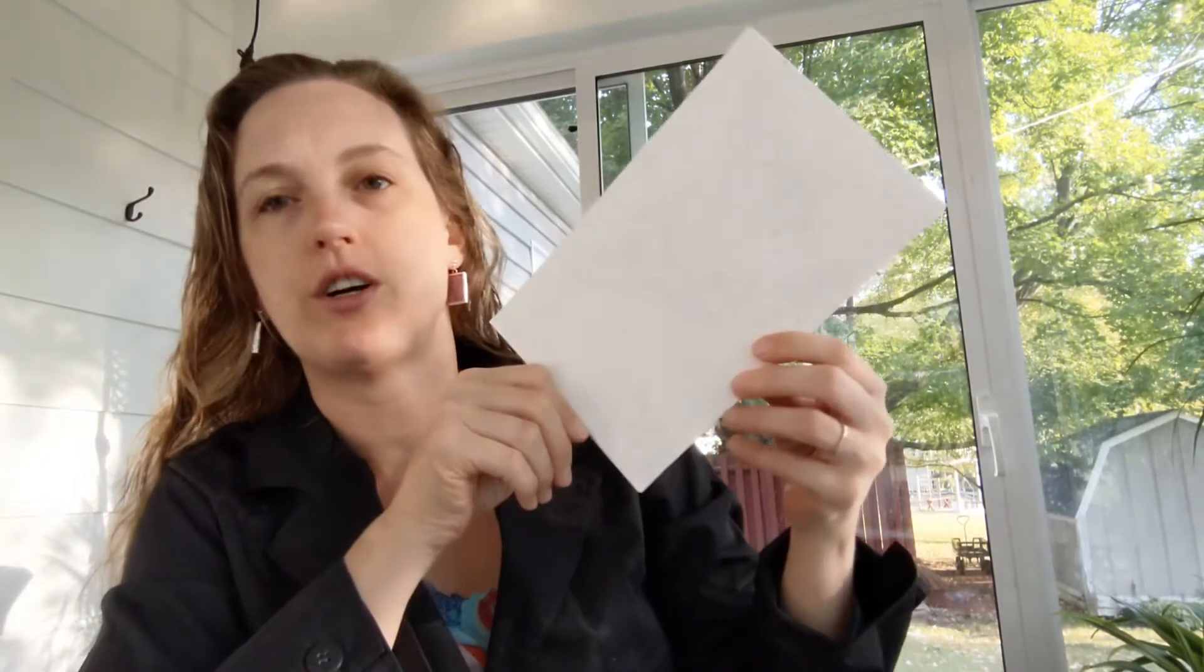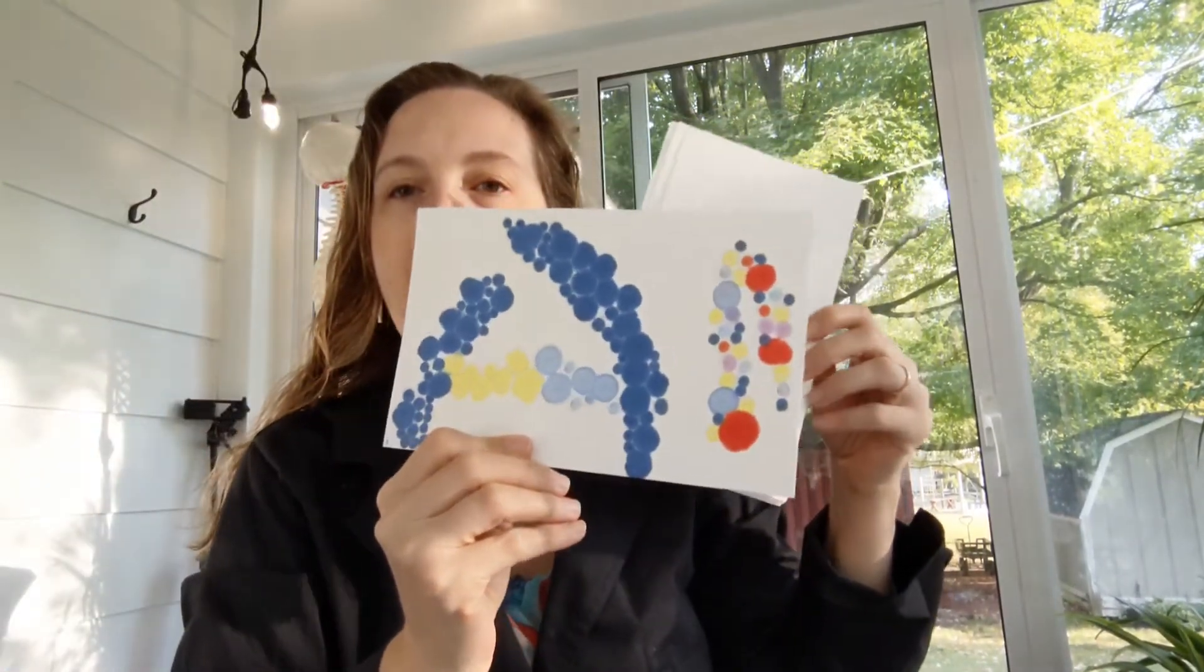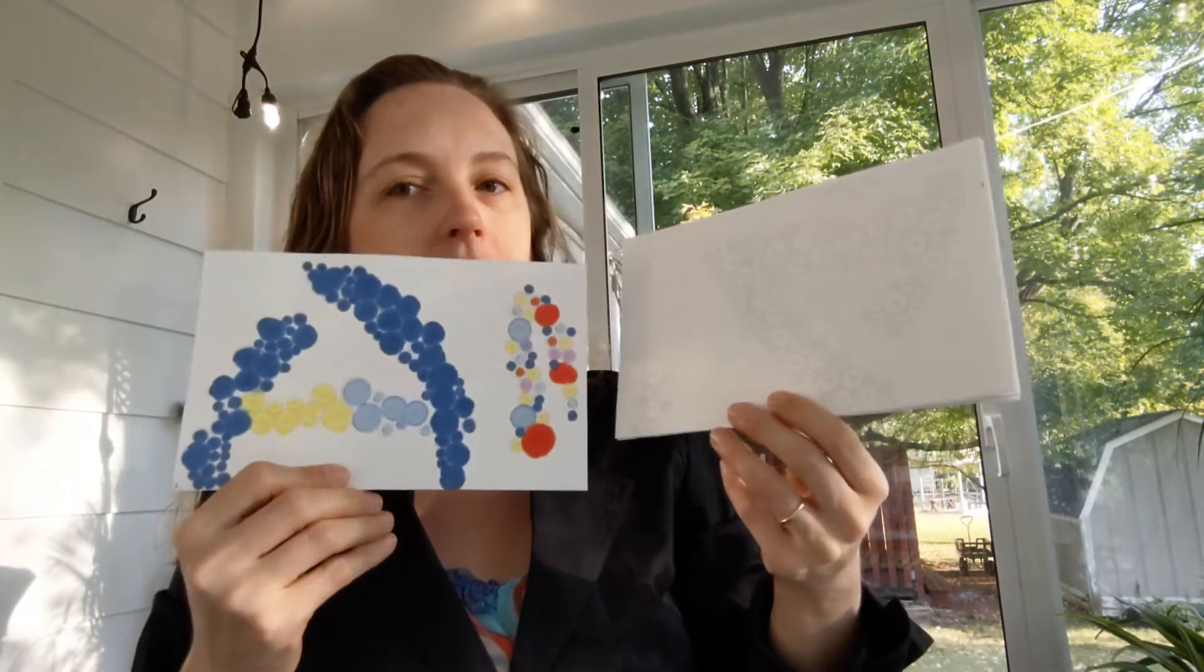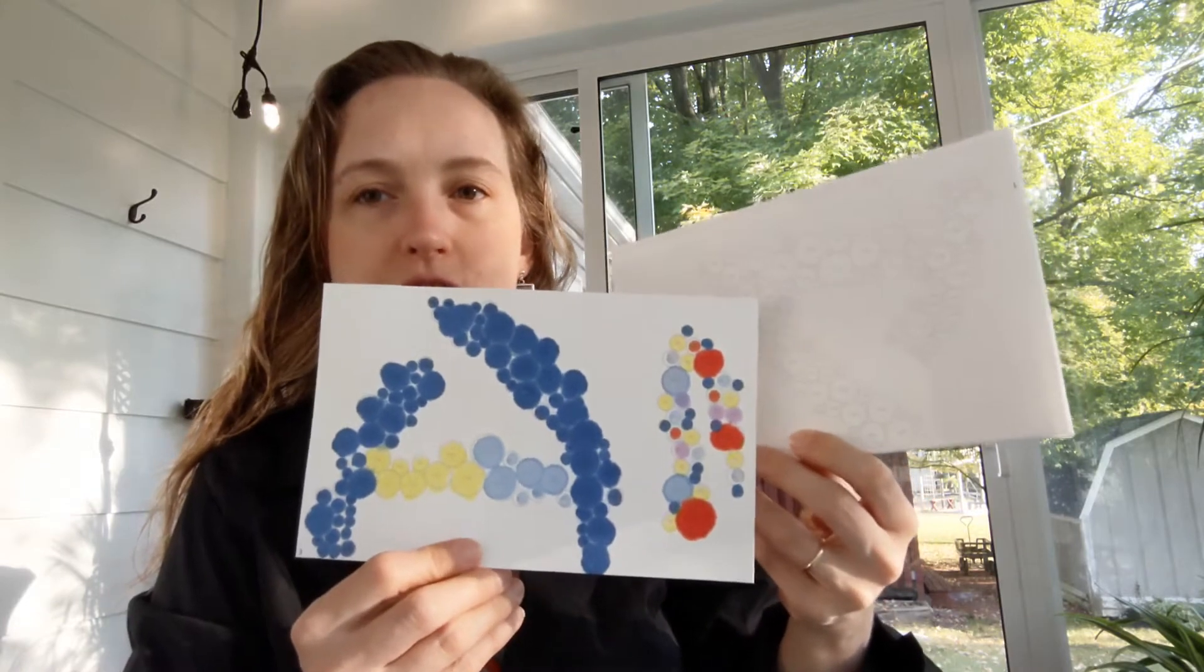When you take the materials out of this large envelope, you're going to get several big sheets, four big sheets. I've already cut them apart. And those are materials for up to 10 lab groups. You'll have these pieces which are labeled 1 through 10. I did number 3 as practice. And each of them has roughly the same number of little circles on it for the students to pipet into.